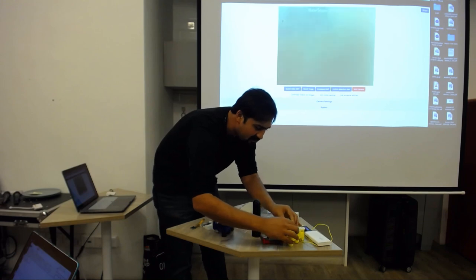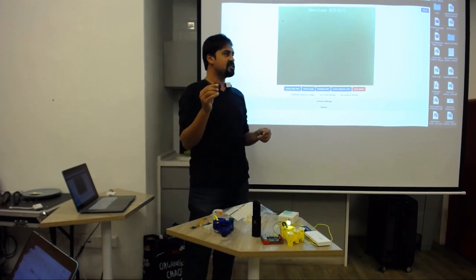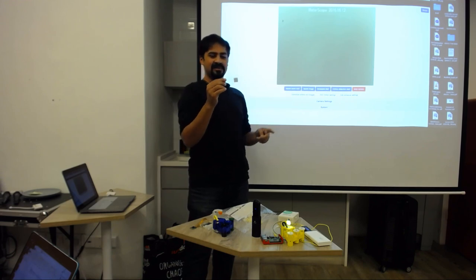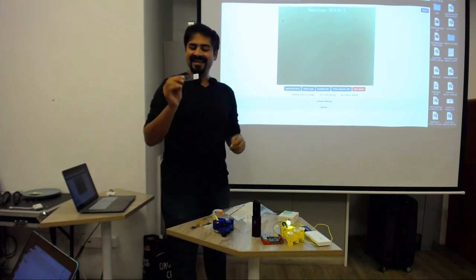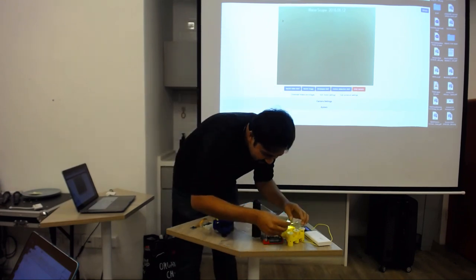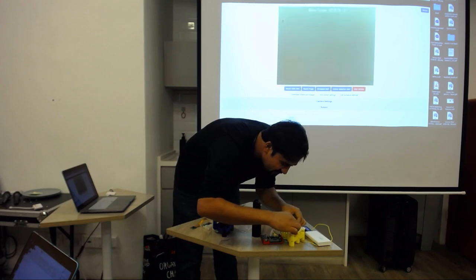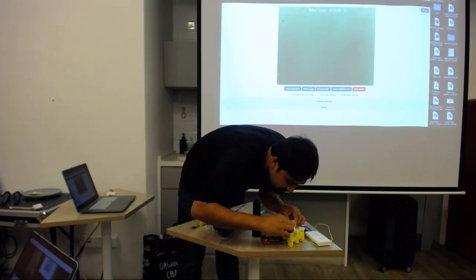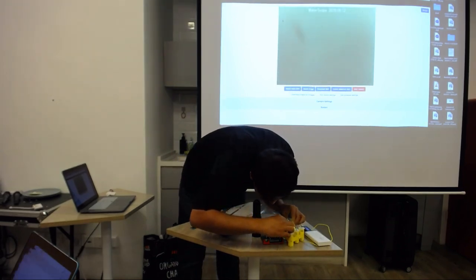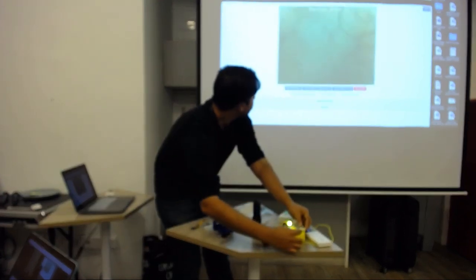Alright, okay. So I have here a slide of something. I don't know what this is. I think Darren is a scientist, he'll be able to tell you, hopefully. But something green in the middle of a slide. That's very specific. Yes, you can jump in with the science anytime. All right, what do you see? Oh, there you go. That's what it is. Okay, so you use the toggles to focus.